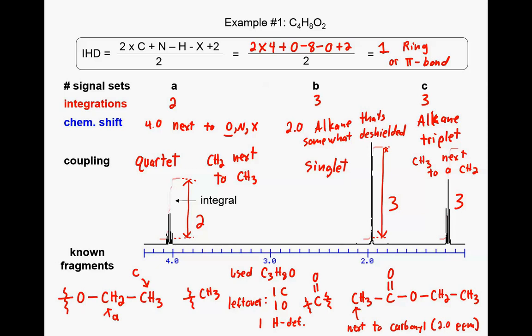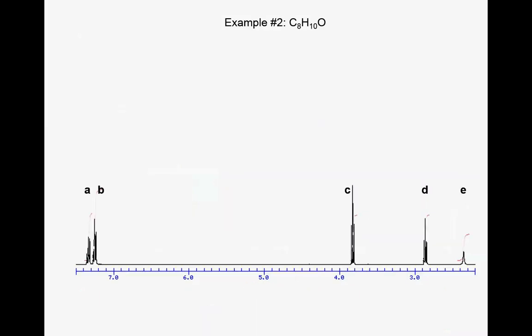So what we're going to be doing is drawing lots of different pieces of information from our puzzle here. Hopefully we end up with some fragments that make sense, so that we can put these things together such that it matches the NMR spectrum that we've been given. Okay, this is pretty much it for today, so we'll do some examples.